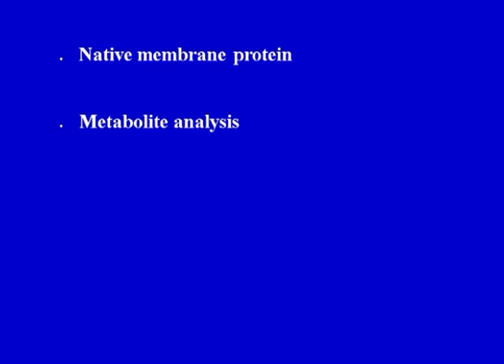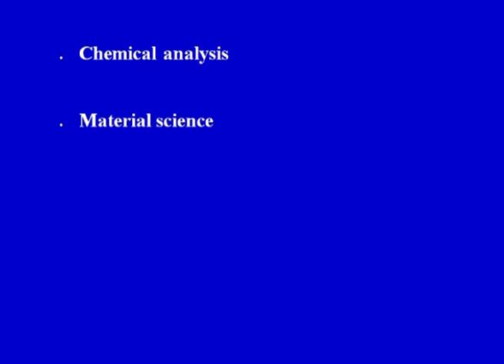It is also utilized in metabolic analysis. So, there are a whole lot of different applications, where chemical and material analysis can be performed in chemistry, physics and biology. NMR spectroscopy is a very powerful and important technique utilized in various areas of biotechnology.